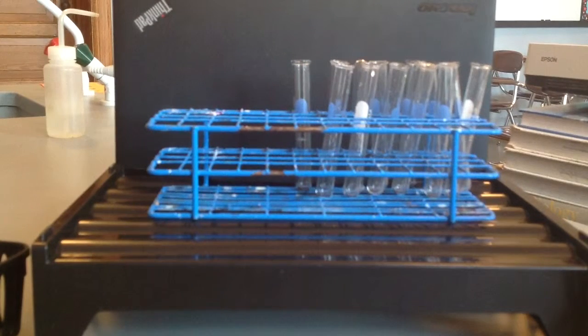Okay, this is the chemical reactions lab for IS1. We'll be doing just a selection of the steps in the test tubes, and you can follow along to make your observations. We'll be starting with step 2, which is on page labeled 73. So we'll start with the first part of step 2, where we're going to take sulfuric acid and combine it with calcium carbonate.